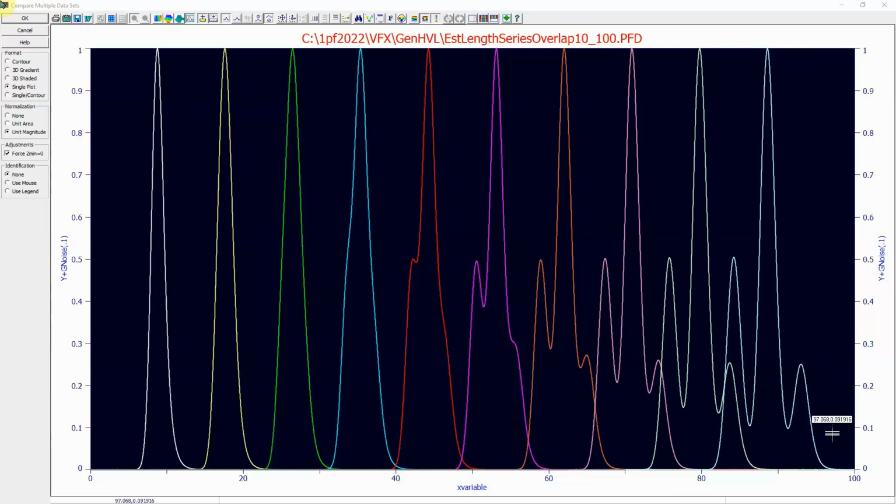Now, what we're going to be looking at here is first a rule of thumb associated with fitting each of these individual peaks as if they were baseline resolved, where we want a full parametric model. We allow all four of the principal chromatographic parameters, including the higher moment parameters, the width and the chromatographic distortion, the tailing-fronting parameter, to be estimated separately for each of the individual components in the overlapping feature.